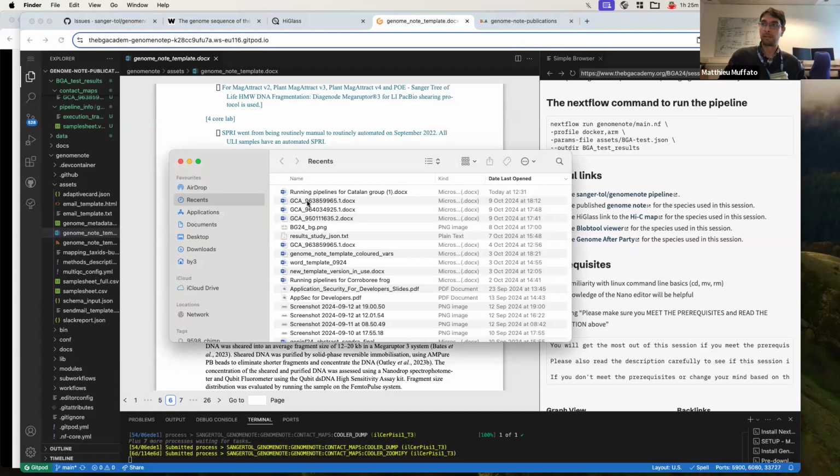I think Beth, you're unlucky, because my run on Gitpod just finished 10 minutes ago. Like I say, I've got the document. I can share it, it just won't be what's actually from this pipeline run. I've got it saved on my computer from earlier. Has anyone that's running it had your pipelines finish? Are you able to have a look now?